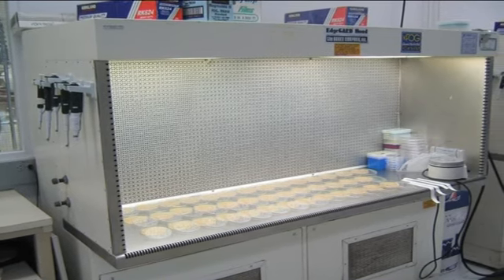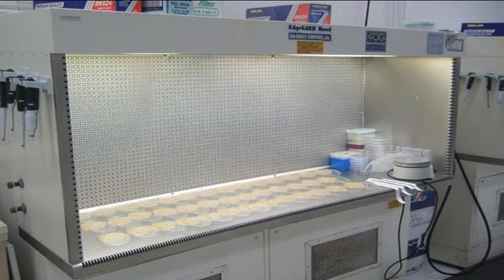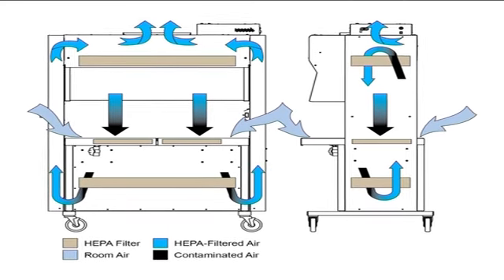Let us discuss what is laminar airflow cabinet. Laminar airflow is a type of fluid such as gas or liquid flow in which the fluid travels smoothly or in regular paths, in contrast to turbulent flow in which the fluid undergoes irregular fluctuations and mixing. In laminar airflow, sometimes called streamline flow, the velocity, pressure and other flow properties at each point in the fluid remain constant. Laminar airflow over a horizontal surface may be thought of as consisting of thin layers all parallel to each other.